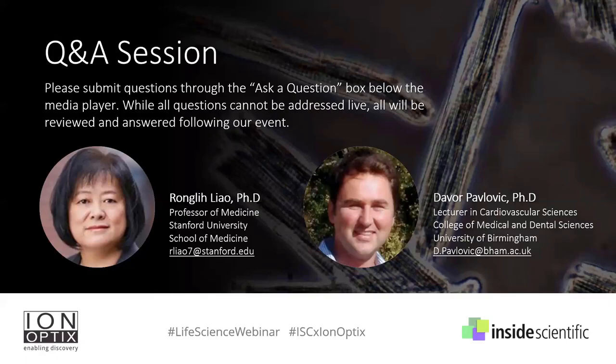Okay, and a good follow-up question is, Rongli, how do you tell if your cells are good quality? So the cells in high quality, even in the calcium solution, should be quiescent and not spontaneously twitching or jiggling. If those cells are doing that in the calcium solution, that means their membrane is slightly damaged. So you actually get calcium overload in some way. Then you will see the cells start twitching and jiggling. And sometimes you can even see almost a calcium wave pass around the myocyte surface. You can see that. Okay, great.